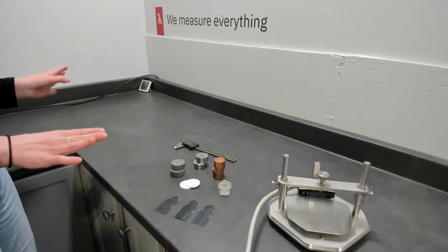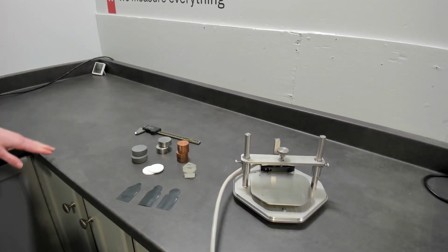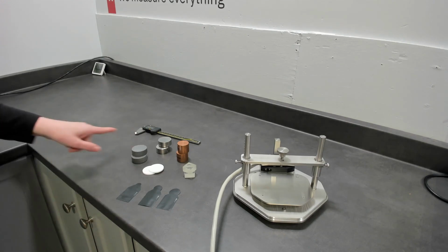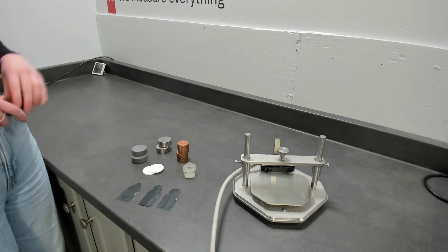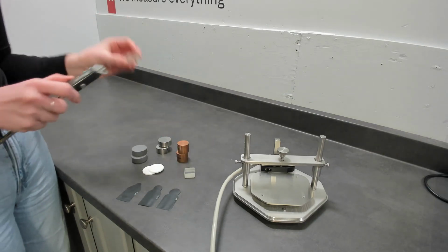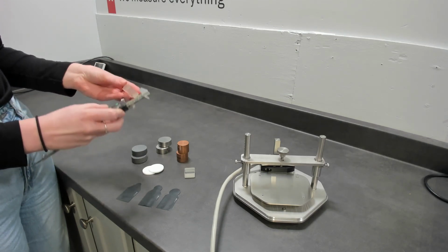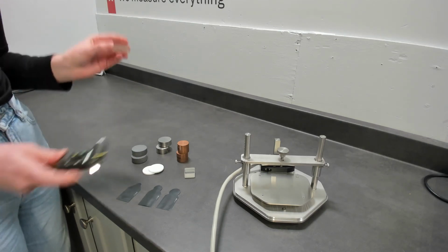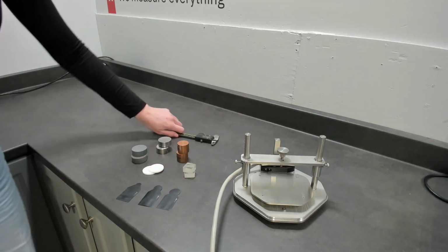So I have a few different samples here set up, all with very different conductivities, different shapes, and different sizes, along with different sensor sizes that would go along with them. So it can be quite daunting to select the appropriate sensor size along with the correct parameters for each sample. So to get started with the iTPS, we just need to first pick our sample. So we're going to use these small Pyrex samples. So all we have to do is measure the radius and the height. And then we can go over to the software and it will tell us which sensor we should use based on these dimensions.